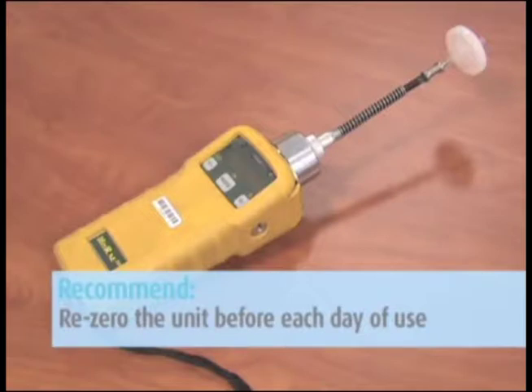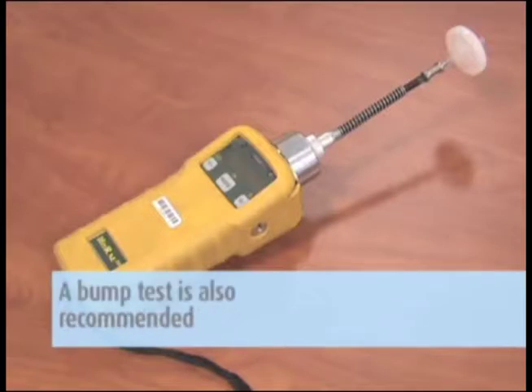If you have a known concentration span gas available, a bump test is also recommended.